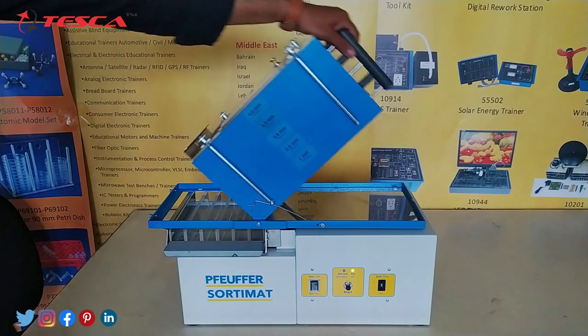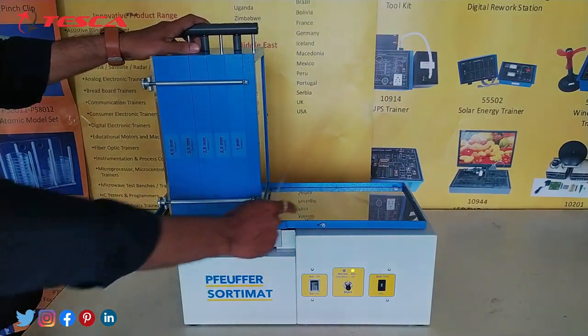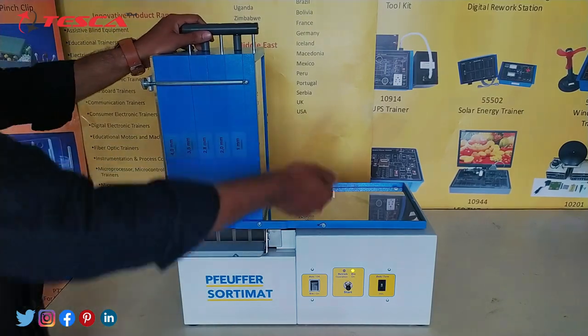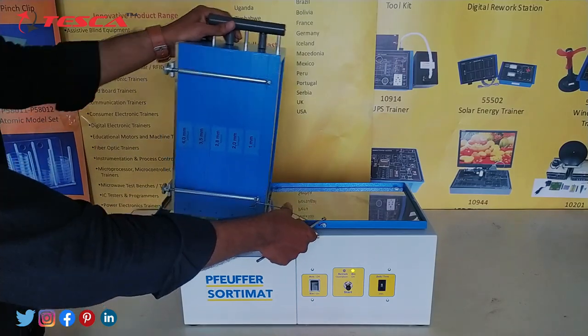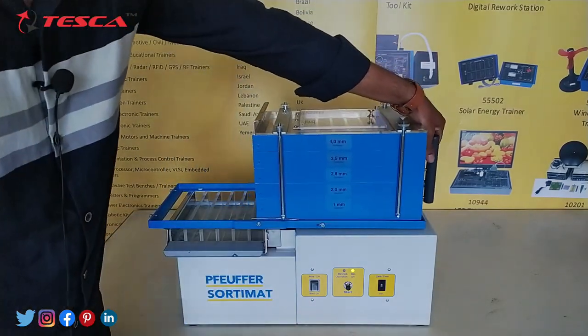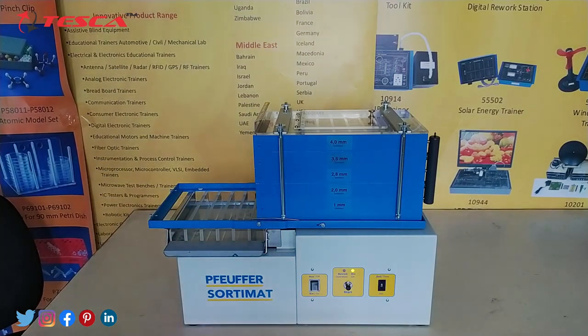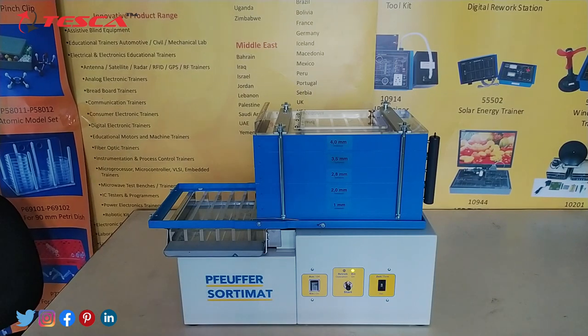When we keep this panel here, this wire locks the system so that it will not go to the back side. And when we have to keep it down, we have to press this wire. So this wire is a safety measure. That is how the working of the sorting machine occurs.